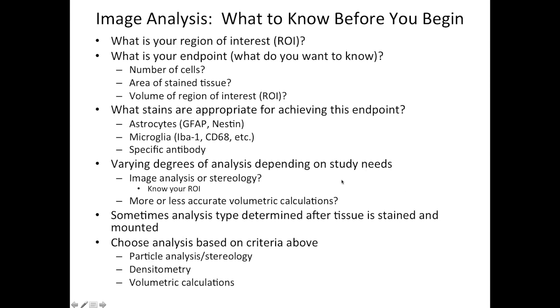And as I mentioned before, if you're doing a preliminary study and you don't need exact volumes, if you're just trying to show a difference, if it's a proof of concept or something like that, then maybe you don't need the really detailed volumetric calculations.